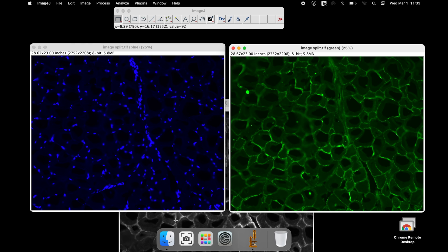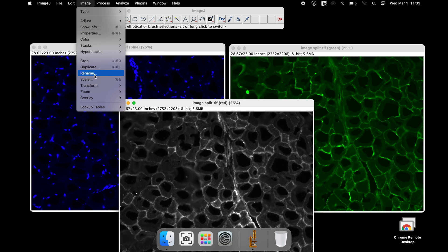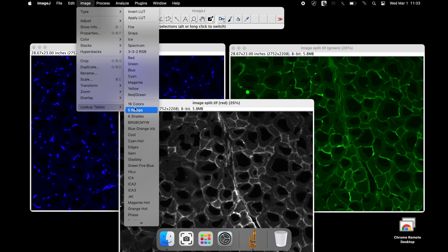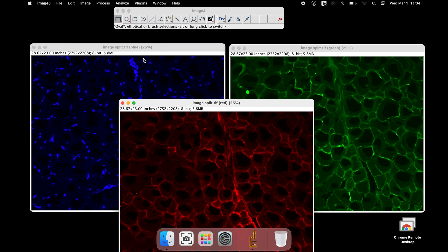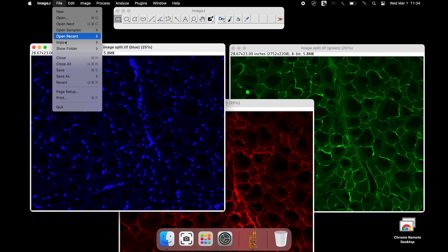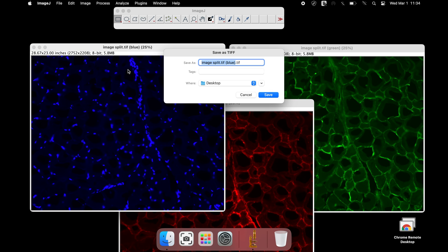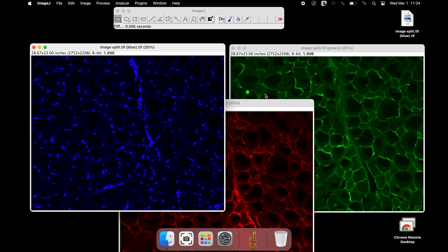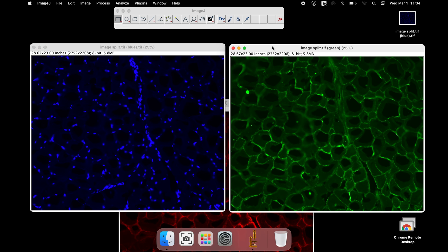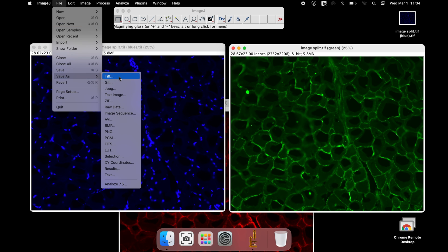Once completed, these images can be saved in any format of your choice. To save the image, click File, Save As, TIFF, and save. The other channel color images can also be saved in a similar way. Scale bars can also be added before saving these images.